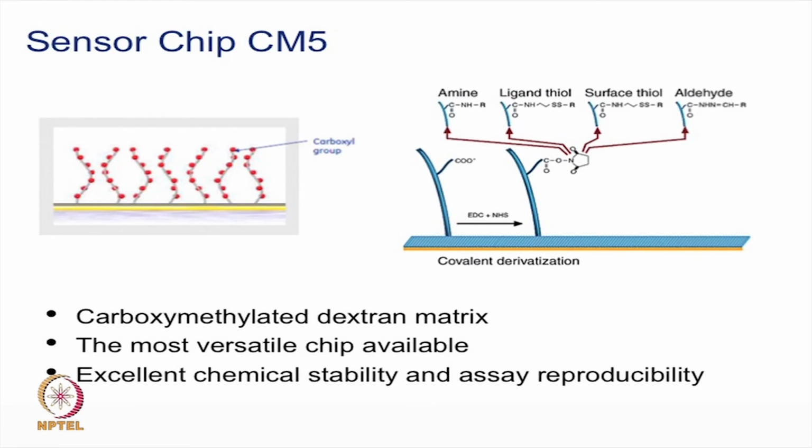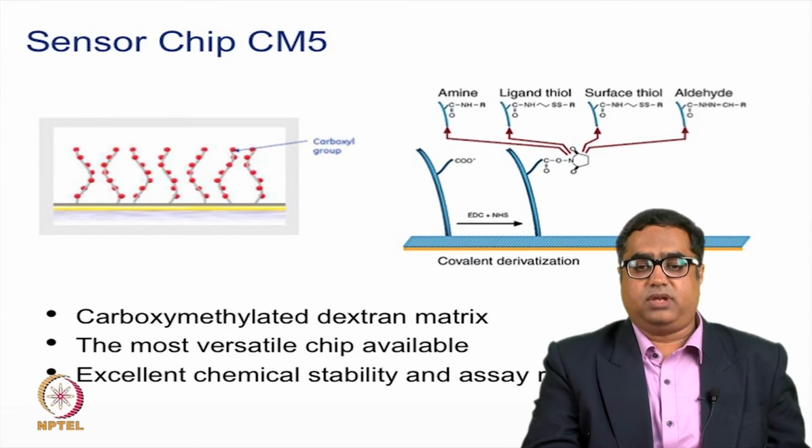The reactive side chains on the basic amino acids or amines are generally used to couple to the surface by amine coupling. Thiols are activated and then used to immobilize on the surface in a thiol coupling, whereas the carbohydrates that are attached on the glycoproteins are used to do an immobilization, and that process is an aldehyde coupling.